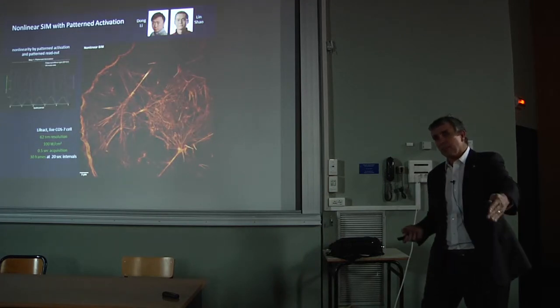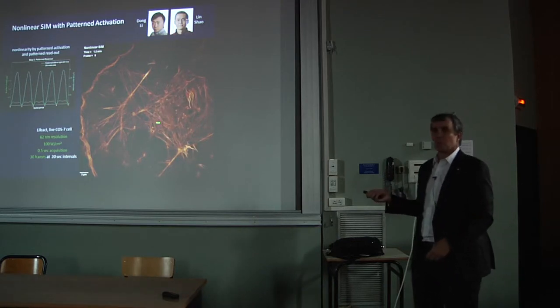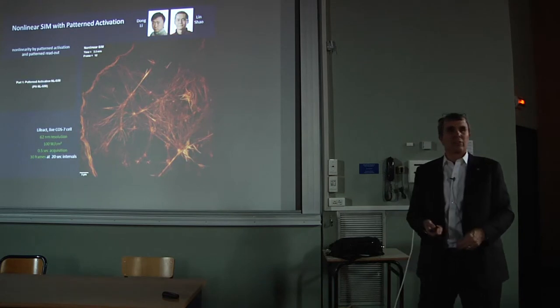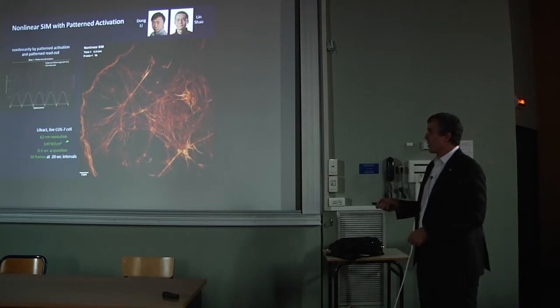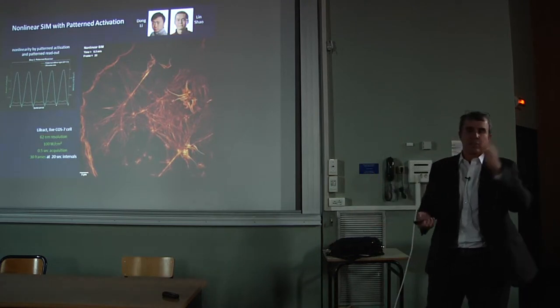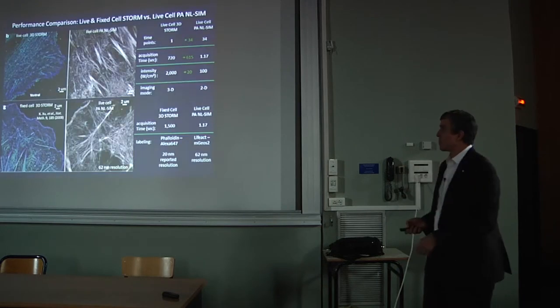It's not as many images as we get with the high NA SIM, because this requires 25 images to reconstruct. The high NA SIM requires only 9, but it still can do live imaging. It's just, again, the trade-offs: spatial resolution for temporal resolution and number of frames.